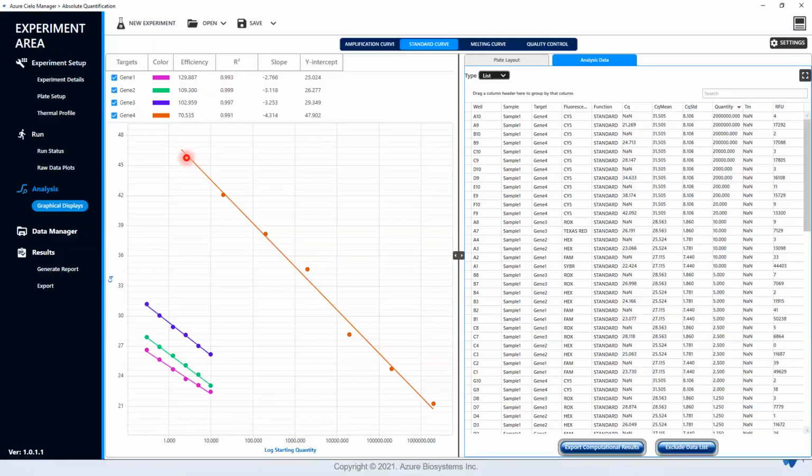You have serially diluted standards. Either you dilute them in tenfold dilution, then when you do the analysis on the software itself, you assign the definitive quantities that you put. Over here, you can use either a designated unit, or, like something I say, weight, copy numbers, or the number of cells. Those can be the quantity itself.